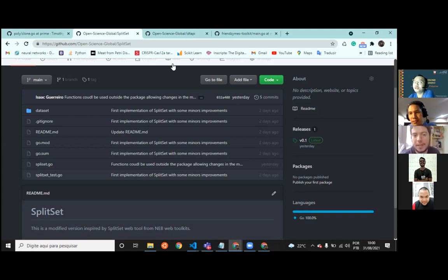So that's the idea, right? Because that's just one of our visions. We would really want to have our own mini primer factory, just enough to cater to the needs of the region. Because right now everything is sourced outside the country. It's expensive, it's time consuming, and it limits what we can do. So maybe moving on to Nanopore.